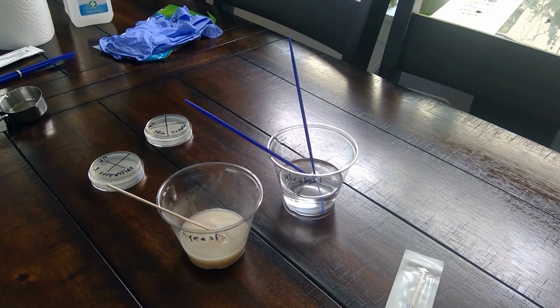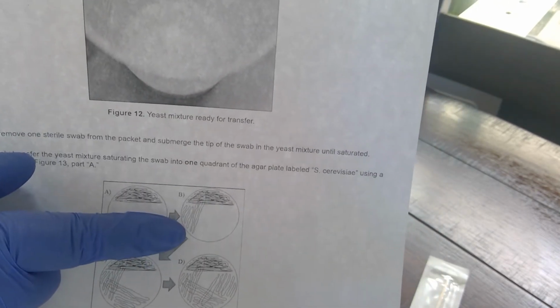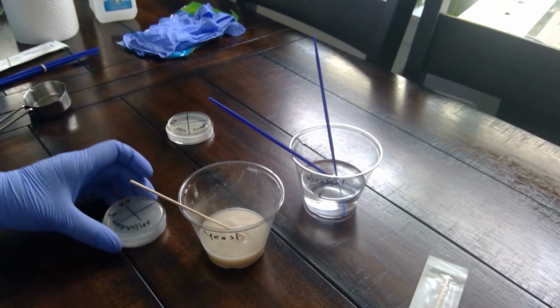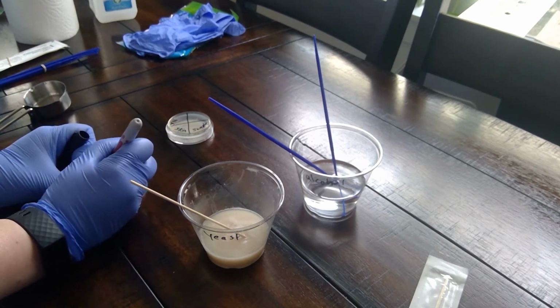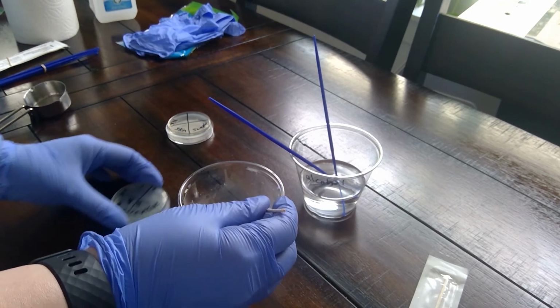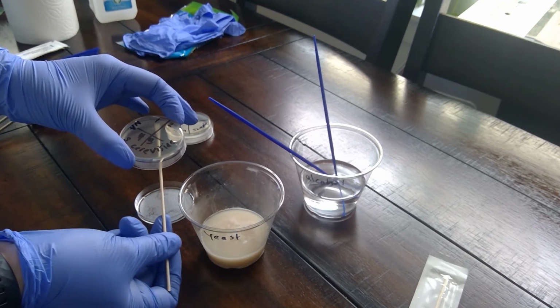And so it references this. We'll put it into one quadrant, and then we'll use the loop to pull it from 1 to 2, then from 2 to 3, and then from 3 to 4. You pull from the center and then work out, if you can see that. So I'll also label this one, 1, 2, 3 and 4. And what we'll do is just lift the bottom up and swipe it into the first quadrant.